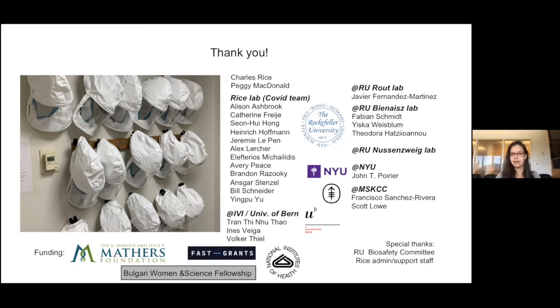Yeah, I guess I can answer that. Including making sure that everything's in place and sequencing what comes out, it takes about 2 to 3 weeks. But the idea is that the system is really modular. So if you want to introduce a mutation in a specific gene, all you need to do is replace this fragment. You don't need to clone the whole thing. But you will have to do another recombination in yeast to get everything in place.